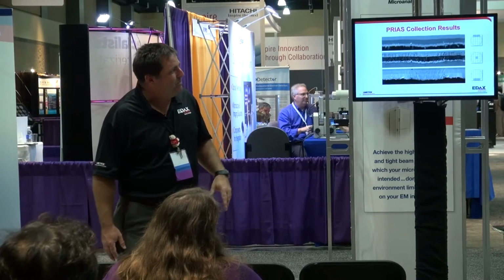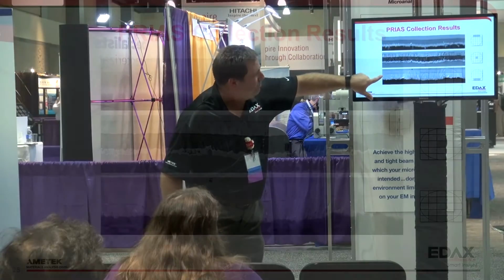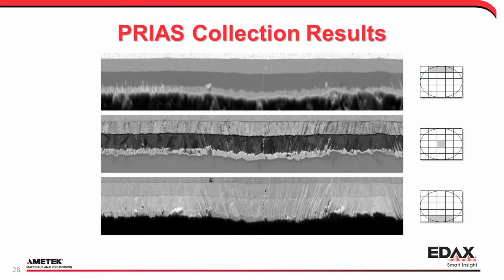I said, well, here are your maps. And you can see immediately that all these layers jump out. You can see this really tiny layer here. You can see the detail, the different phase contrasts that jump out compared to the earlier images. And it was immediately like, yeah, that shows exactly what I want to show.